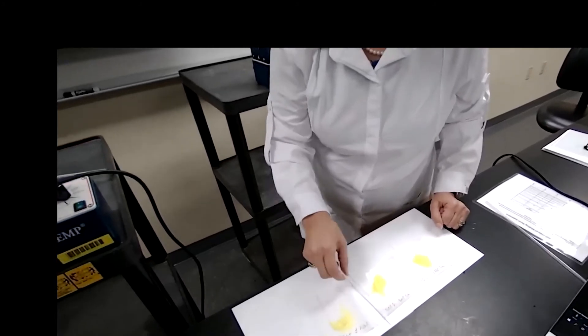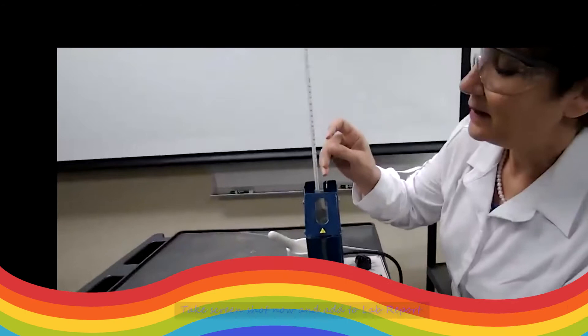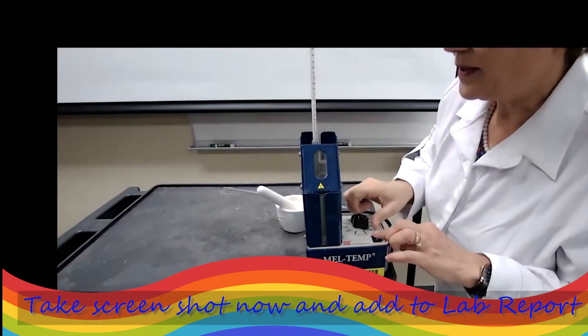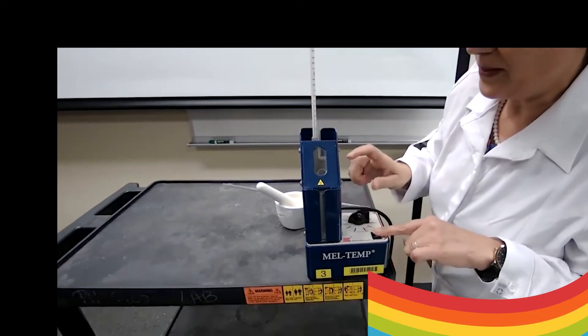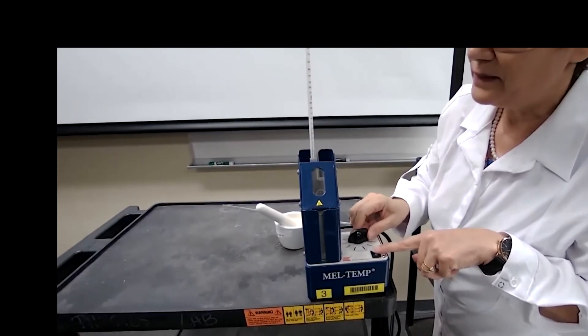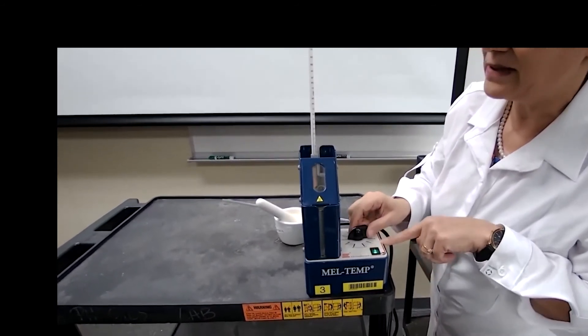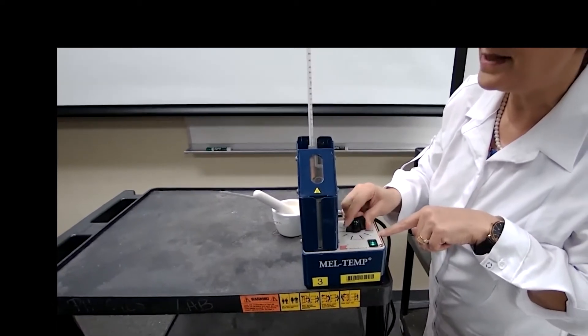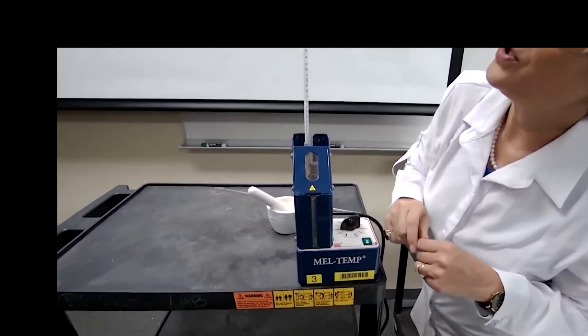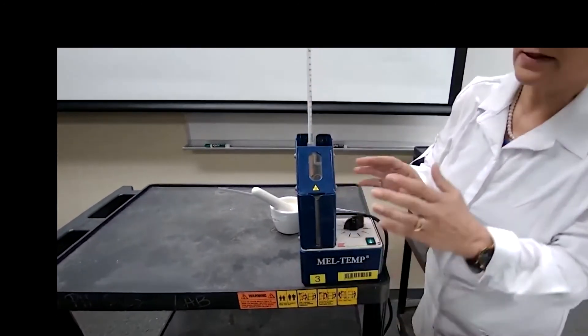I'm going to take the 50-50% first and I place it in the melt temp, turn it on. We are going to set it at low because fluoranone melts at 84, with the impurities it's going to be even less. So let's do it at less than two. I will show you a picture when it starts melting or when it is melted completely.